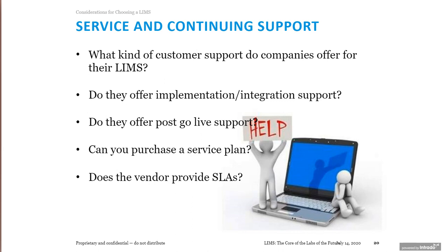Service and continuous support. What kind of customer support does this company offer for their LIMS? Am I going to have support during the journey of implementing a laboratory information management system? Am I going to have post-go-live support? Can I purchase a service plan? And important, very important, does this vendor offer a service level agreement, like a 24/7 follow-the-sun service?